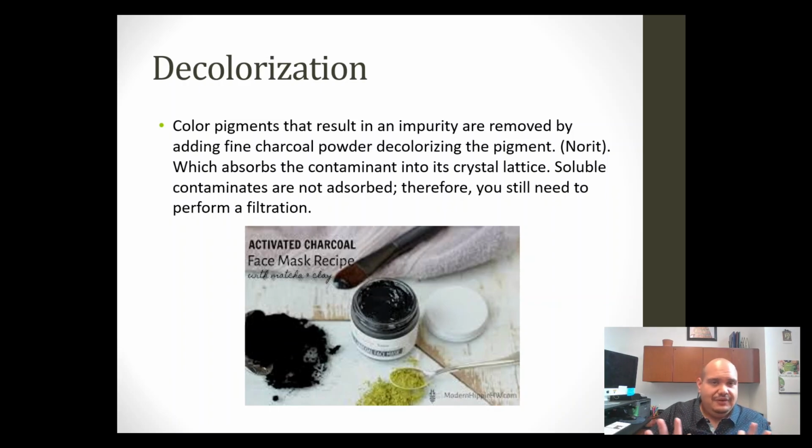If you don't see any more yellow on your sulfanilamide, then you're good to go, and you can start drying and get your melting point to identify that this thing that you recrystallized is pure sulfanilamide. If you don't know what your thing is, just make sure it's clear and colorless. If it's an unknown, that's standard across the board.